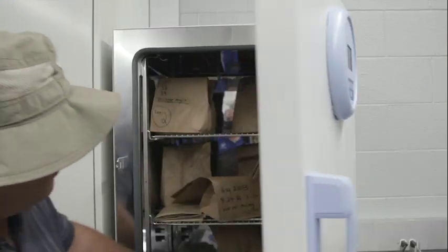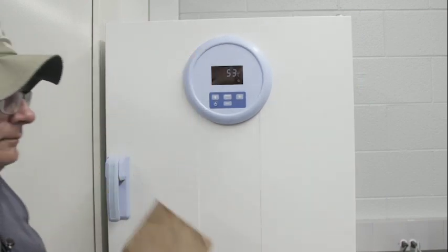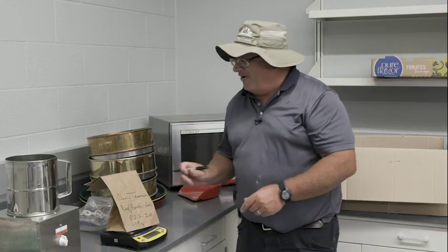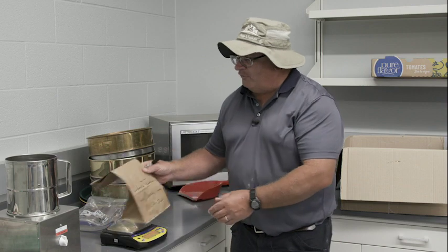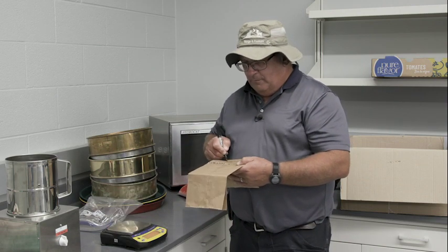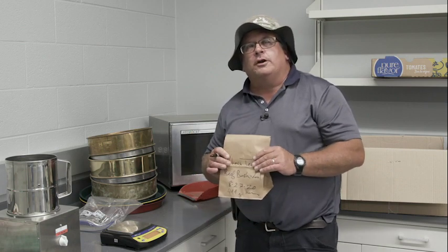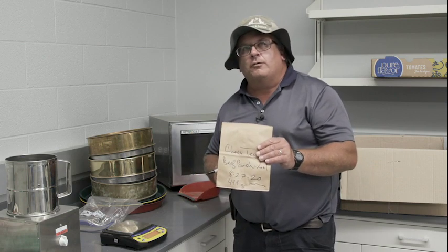It's been overnight and we're getting the sample out again and we're going to re-weigh it to determine the dry matter. Once we get the dry weight, we'll copy it down and record it on our data sheet. Now we're going to head up to the grinding facility and grind this sample to get it ready for forage quality analysis.